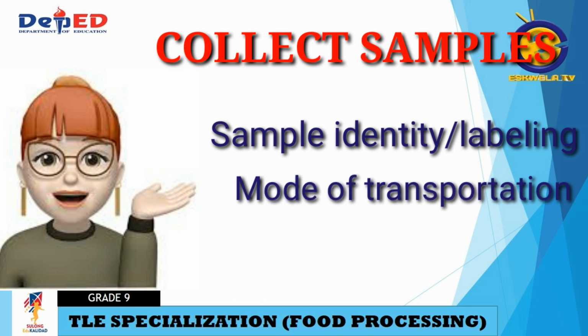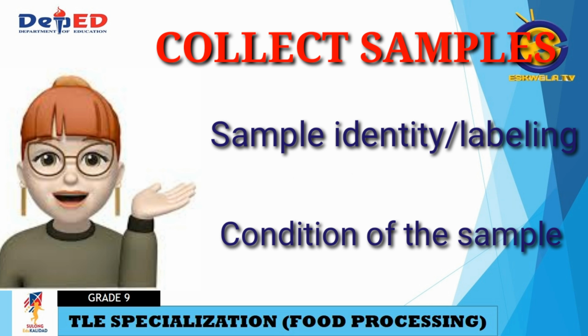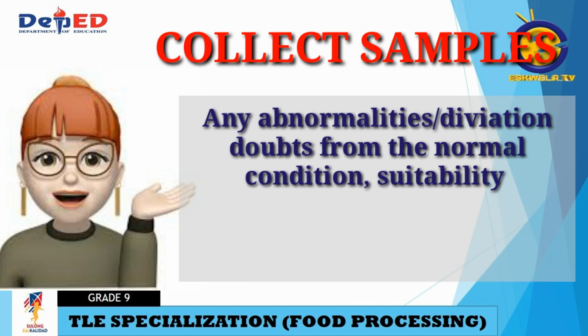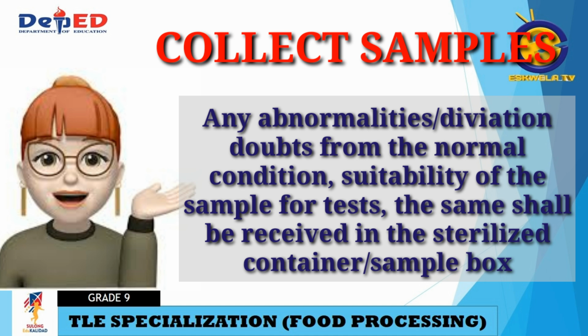They also check the mode of transportation, condition of the sample including packaging, sample quantity, verification of fees, parameters to be tested against the customer declaration or requirements, any abnormalities, deviations, or doubts from the normal condition, and suitability of the sample for test. The sample shall be received in a sterilized container or sample box.